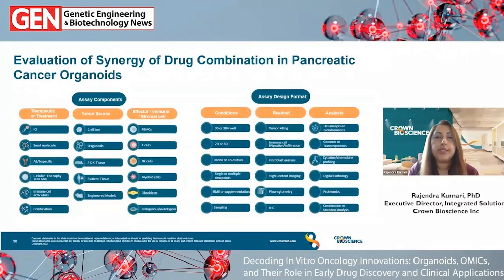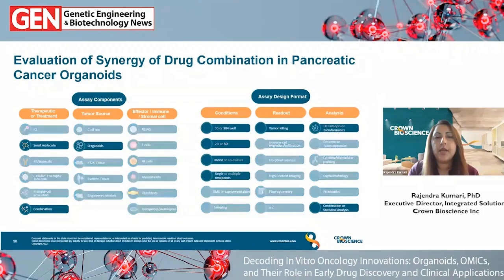In another organoid study, the synergy of drug combinations was assessed. And this was quite a simple study based on small molecules, a couple of organoids, but in a high throughput way, so that we could actually do different combinations and just simply looking at tumor killing.